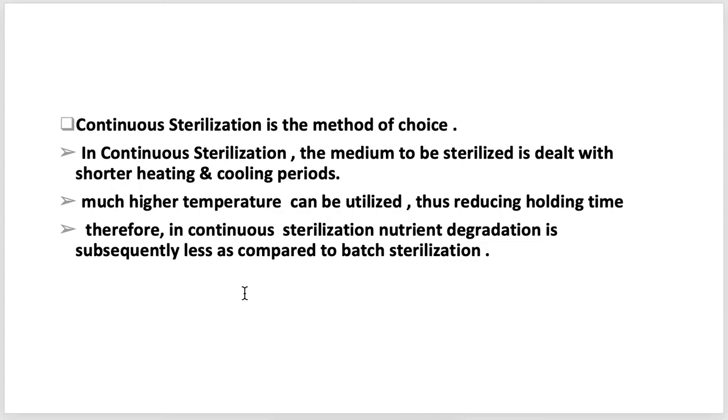But in contrast, in continuous sterilization, the medium to be sterilized is dealt with shorter heating and cooling periods, and as much higher temperature can be utilized, the holding time is reduced. Therefore, in continuous sterilization, nutrient degradation is substantially less as compared to batch sterilization.